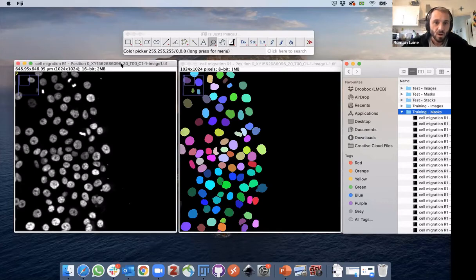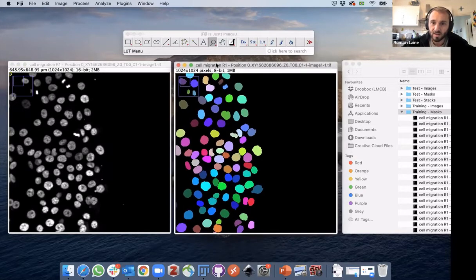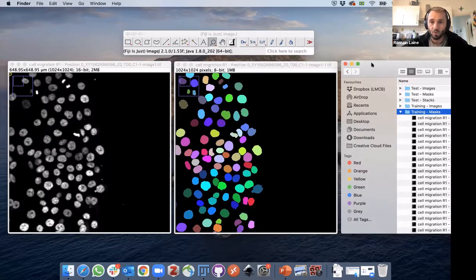Okay, so this is the burden of the user. This should be clear. Providing a training data set that is efficient and relevant is the burden of the user. And that will basically become the bottleneck for all deep learning methodology. What we provide through this platform is essentially a way to make all the rest of it really easy. But that first step of generating training data of good quality is typically the burden of the users.